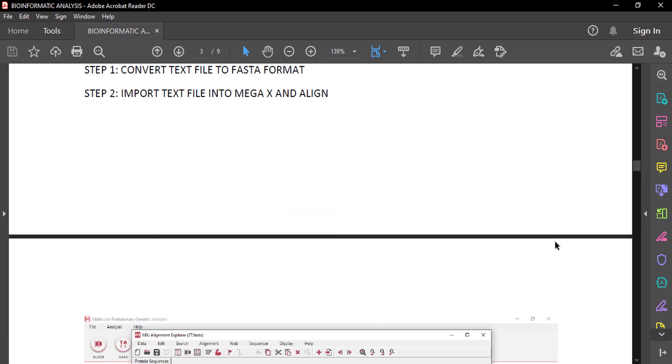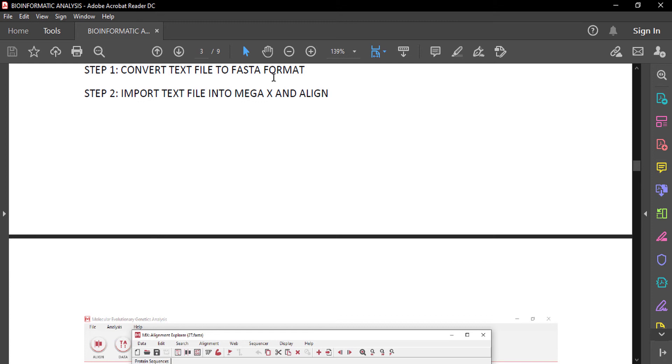To recall all the steps: First, we need a protein sequence that we can download from UniProt. Step one is to convert the text file into FASTA format by changing the extension .txt into .fasta, and then import the text file into MegaX.